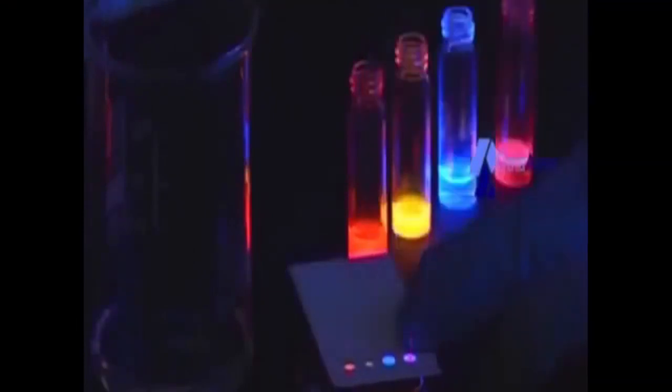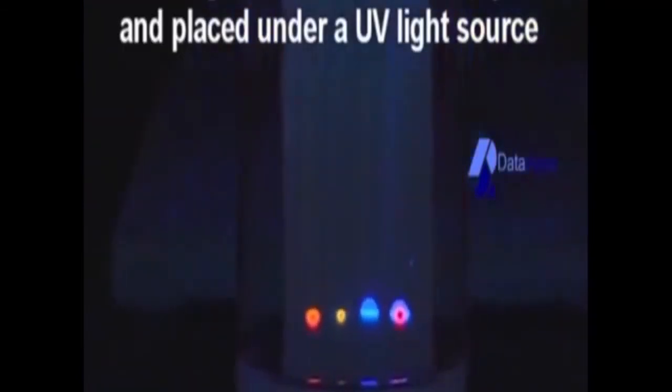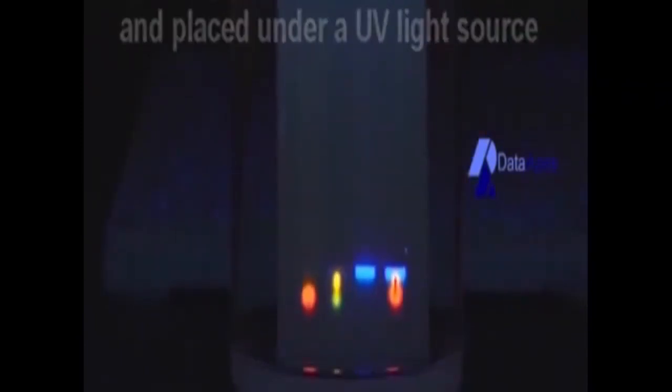Let us look at one more example of thin layer chromatography. We will talk about fluorescent compounds. The experiment is done under UV light. The first spot on the right is a mixture of unknown compounds and the remaining three spots are pure compounds. Using TLC we were able to see the number of components in the mixture. Roughly we can see three different spots on the TLC plate.